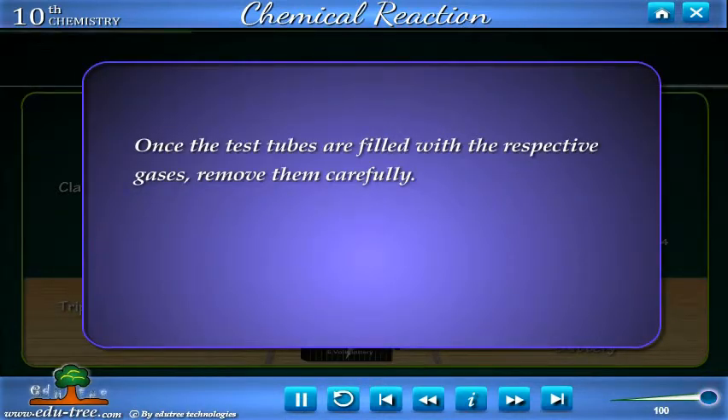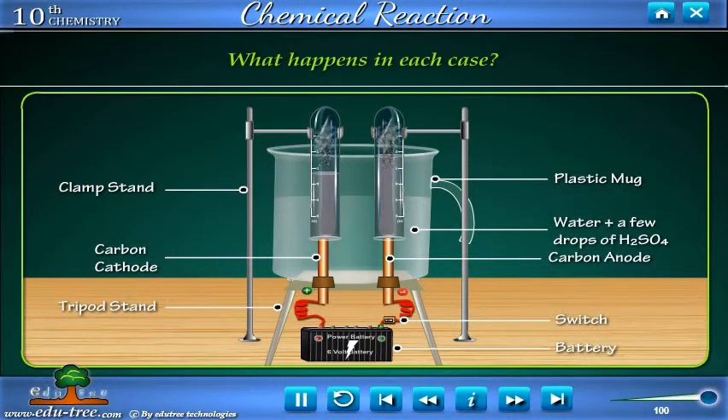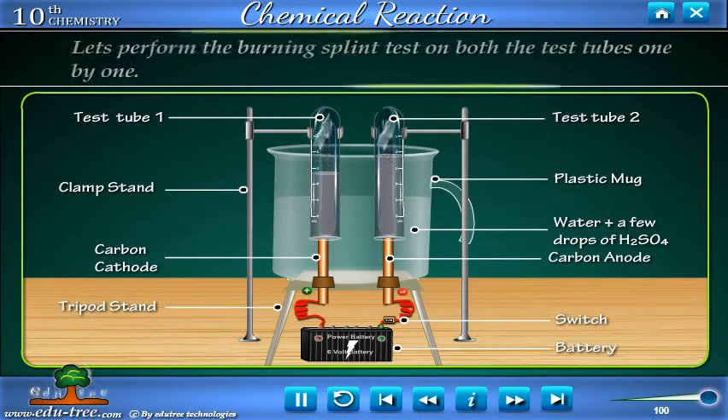Once the test tubes are filled with the respective gases, remove them carefully. Test these gases one by one by bringing a burning wooden splint close to the mouth of the test tubes. Let's consider the test tube covering the cathode as test tube 1 and the one covering the anode as test tube 2, and perform the burning splint test on both one by one.